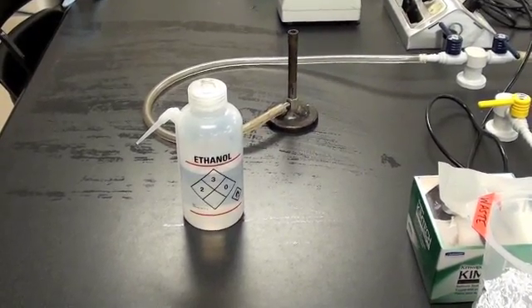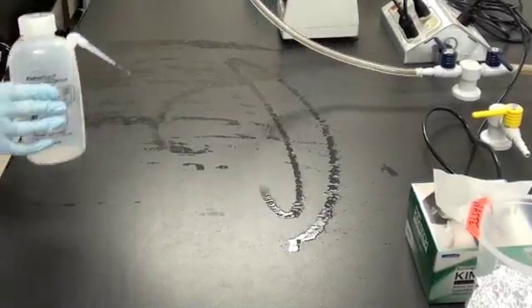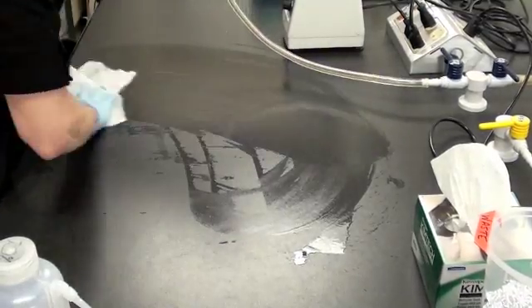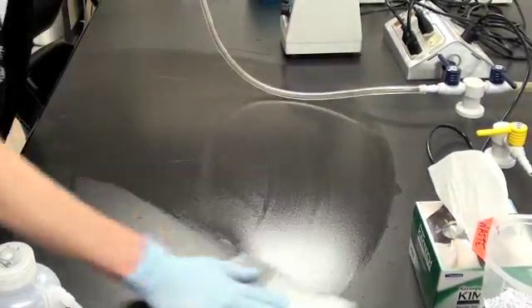We're going to repeat the process with ethanol. Again, spraying, wiping, and waiting for the ethanol to evaporate. When the ethanol has evaporated, we'll light the Bunsen burner.